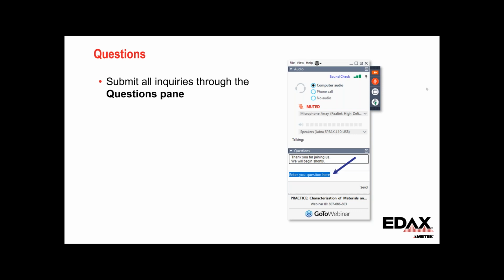So really what you need to do is look at the solid angle of your pixel, and that's going to tell you. Yes, theoretically, as you go from 512 by 512 to 256 by 256, you are cutting the absolute angular precision that you could theoretically achieve in half, but in practice, the numerical error gives you a floor, and you don't start running into that floor until below something like 64 or 32 squared patterns.